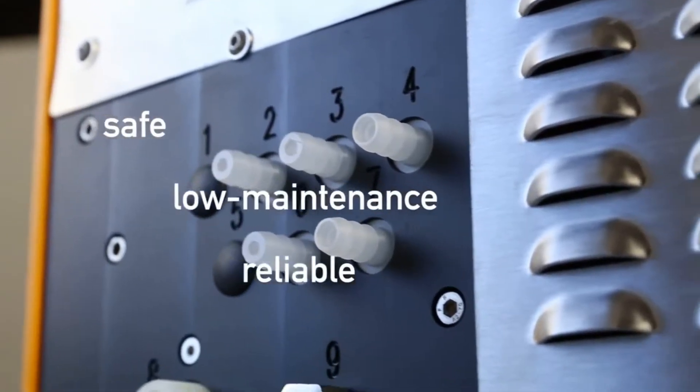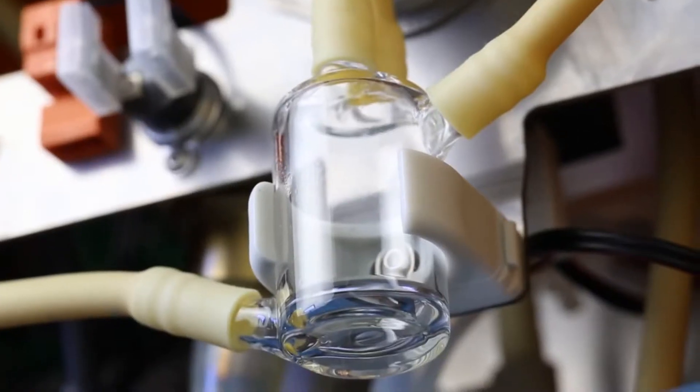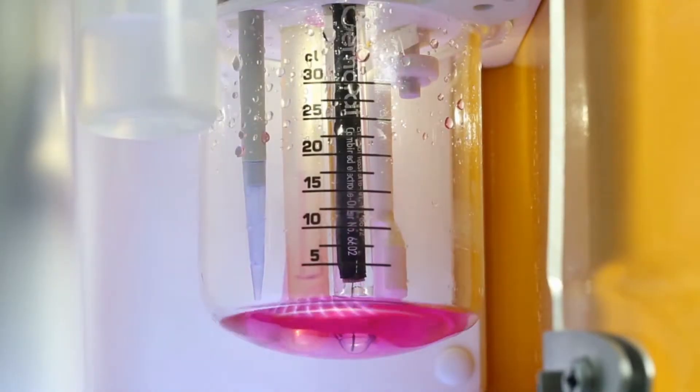VapoDest is extremely secure, low maintenance and reliable. Virtually no other comparable device generates such low total operating costs.